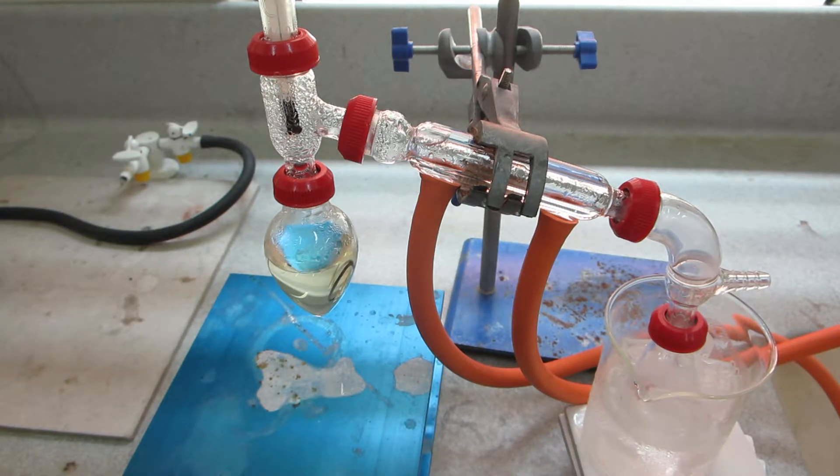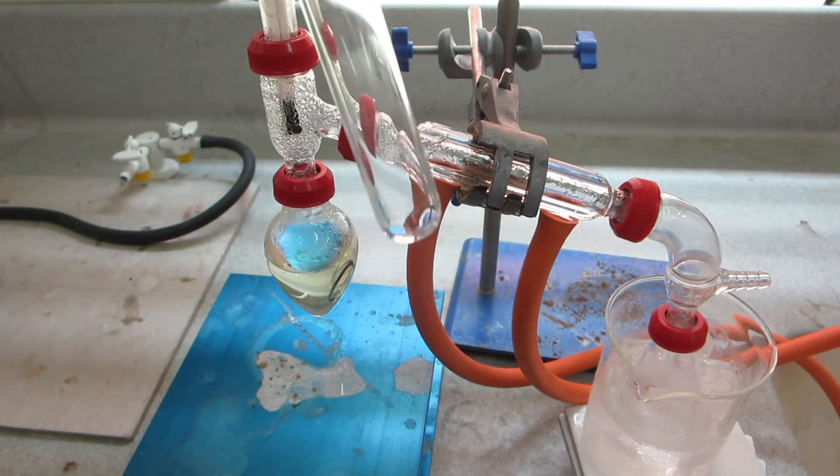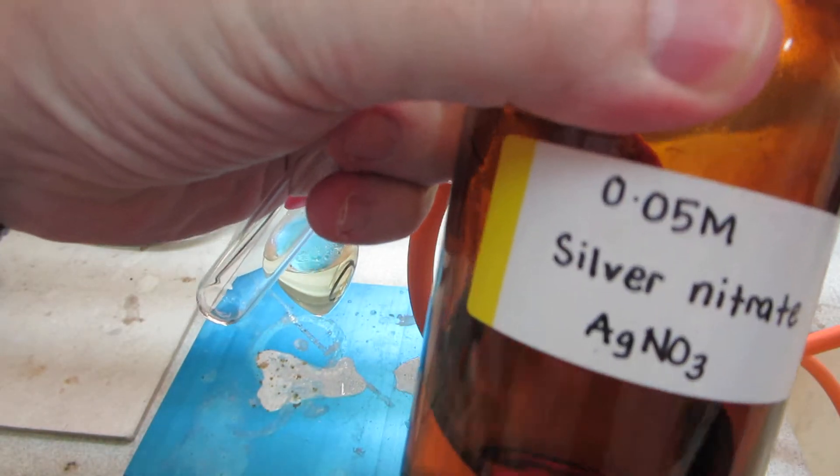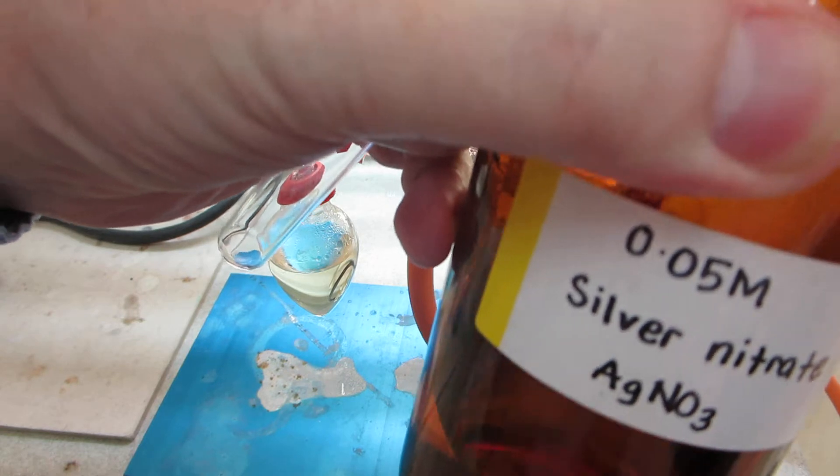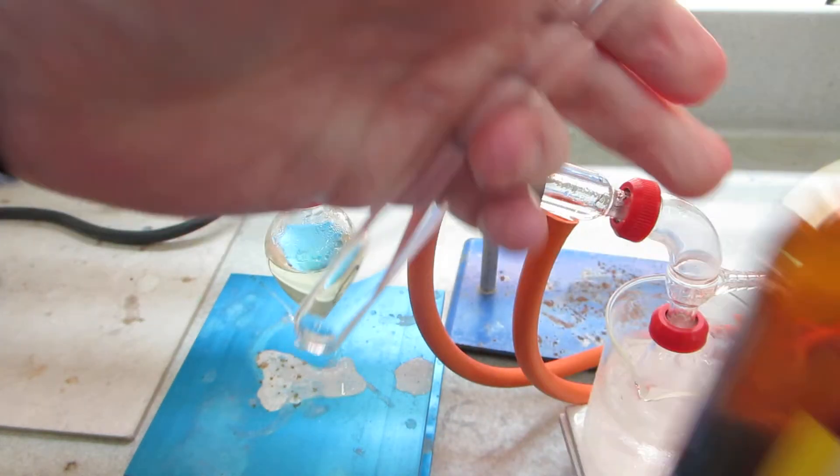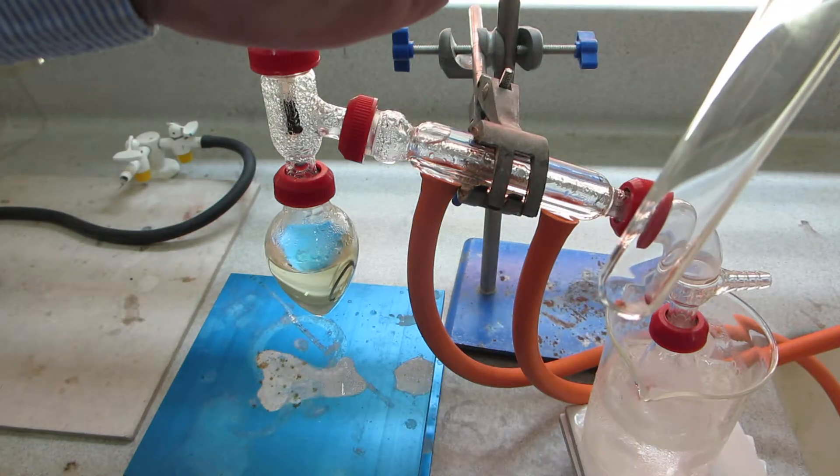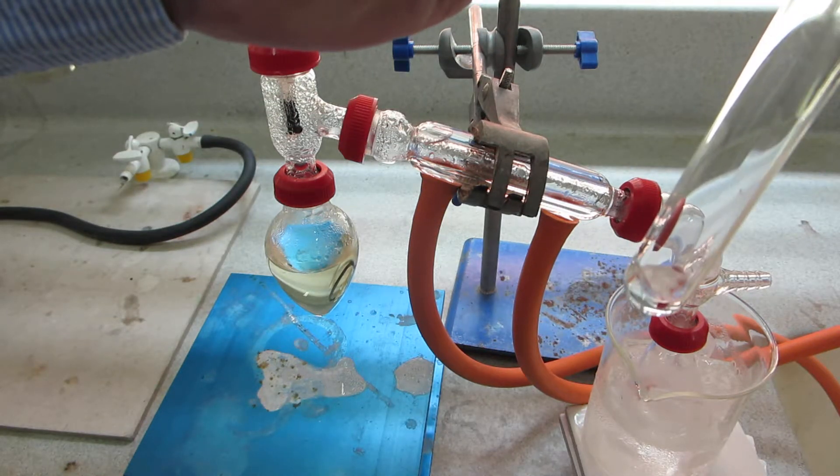In order to do that we need to prepare our Tollens reagent. This will of course be carried out in a test tube at test tube scale, and the first thing we need is about a mil, or one centimeter cubed, of 0.05 molar silver nitrate. Well, one to two mils should suffice.